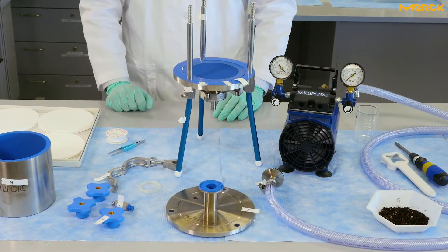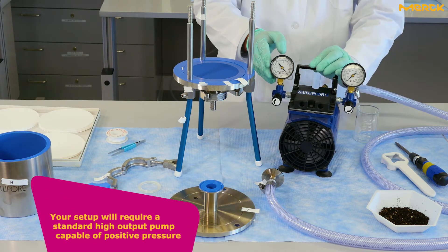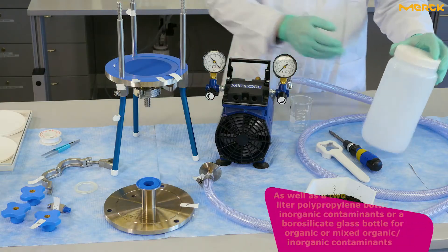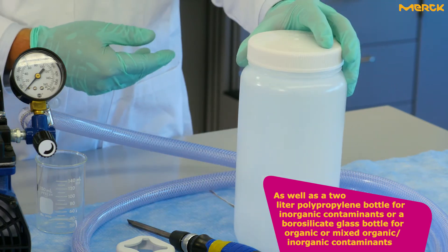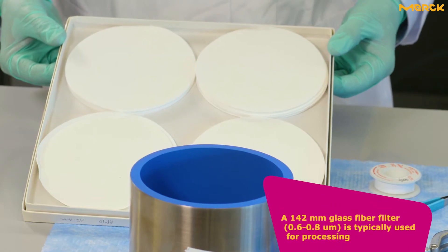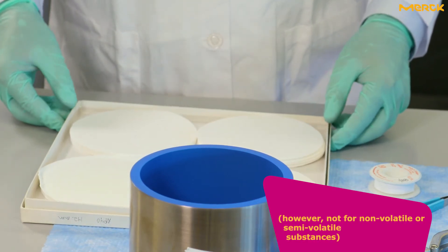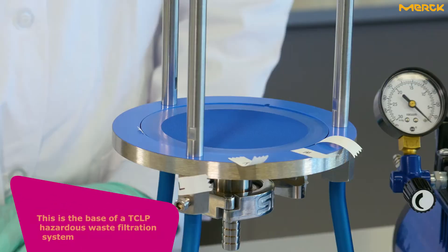This is the TCLP hazardous waste filtration system. Your setup will require a standard high output pump capable of positive pressure, as well as a 2-liter polypropylene bottle for inorganic contaminants, or a borosilicate glass bottle for organic or mixed organic-inorganic contaminants. A 142 millimeter glass fiber filter is typically used for processing. It should be washed with one normal nitric acid if metal analysis is performed, however not for non-volatile or semi-volatile substances.